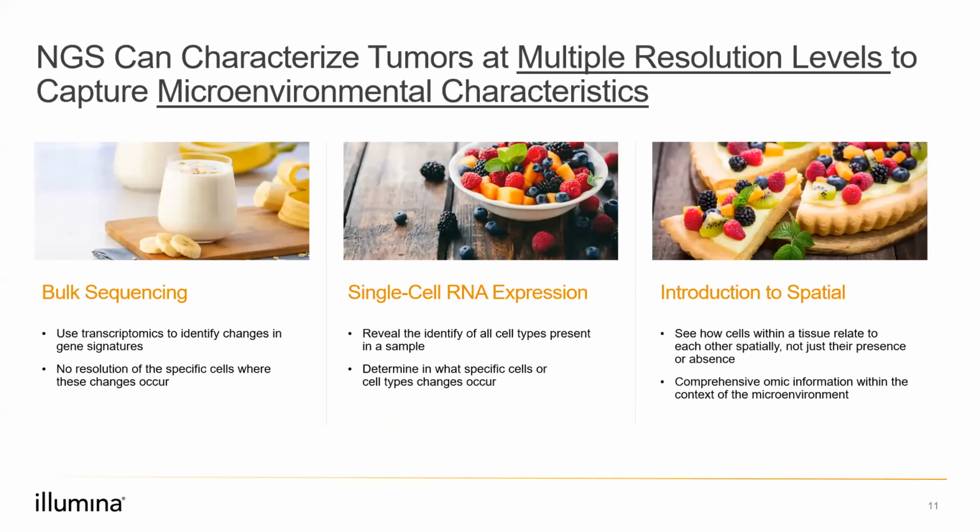And traditionally, sections of tissues or a population of cells are sequenced together in a method called bulk sequencing, because many cells are lysed at once and sequenced at once. So this approach reveals the average gene expression among the population of cells. This remains a relatively simple, cost and time effective, and reliable way to profile cancer samples. However, since the cells within the same cancer sample are heterogeneous, next generation sequencing at the resolution of a single cell adds increased resolution to analysis, which has been perfectly highlighted by the two speakers before me.